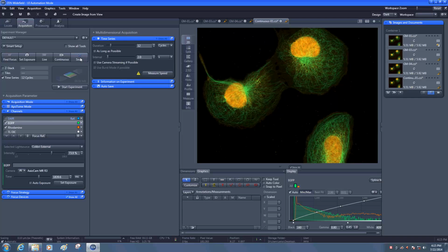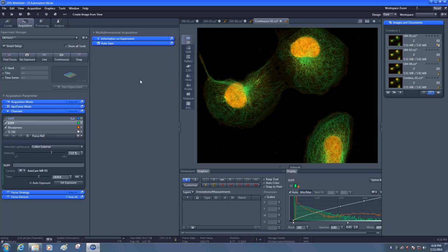I should note here that the setup of these multidimensional experiments is going to be addressed in complementary videos, so if you're interested, please follow up as is appropriate for your needs.